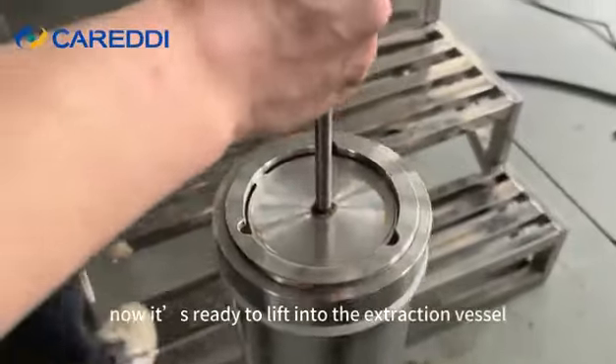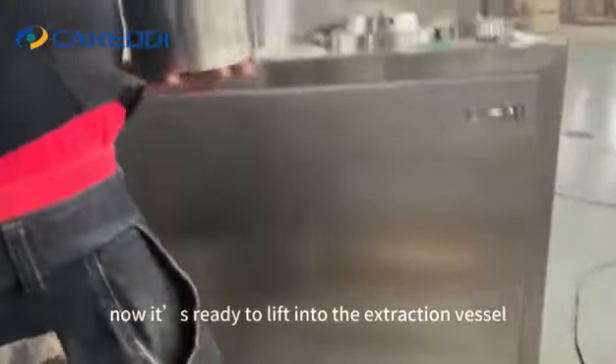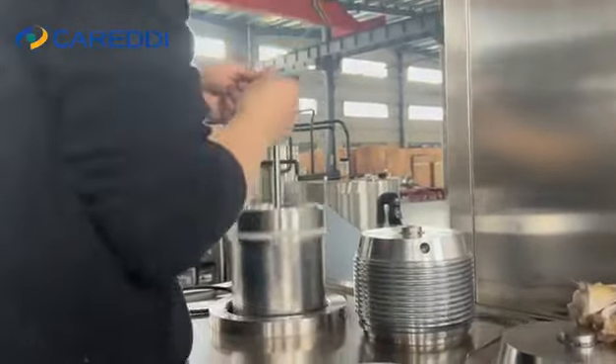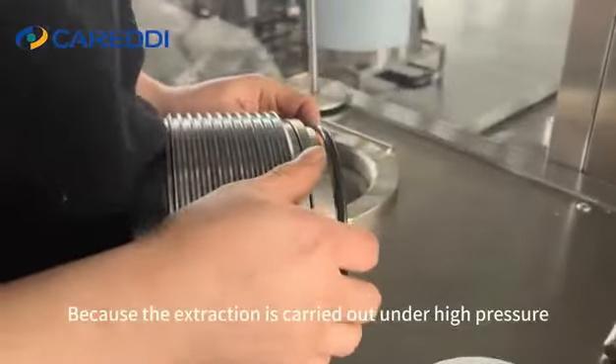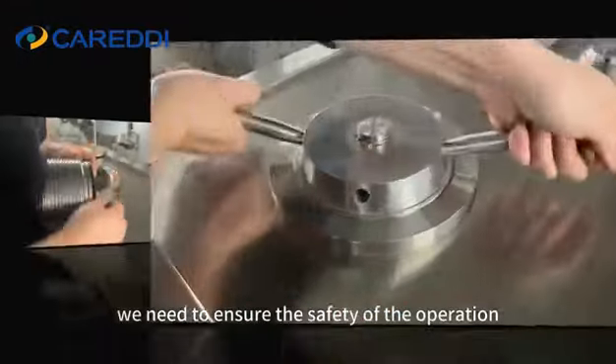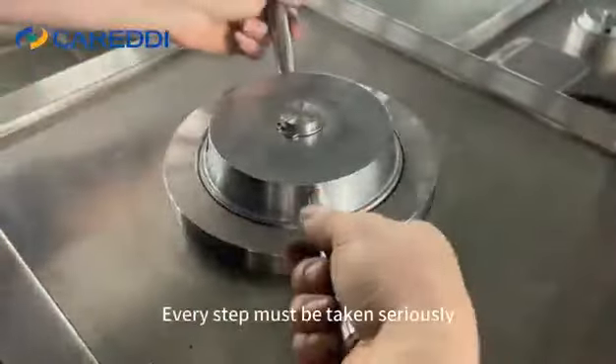Now it's ready to lift into the extraction vessel. There are more sealing steps awaiting us, because the extraction is carried out under high pressure. We need to ensure the safety of the operation — every step must be taken seriously.